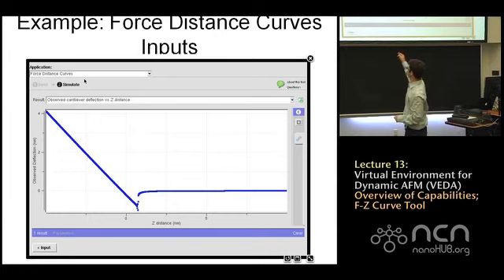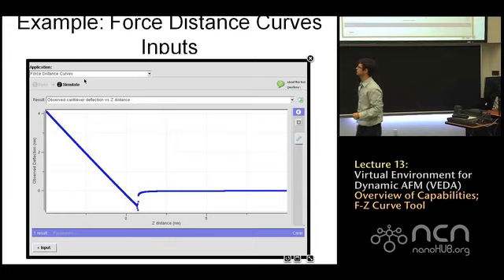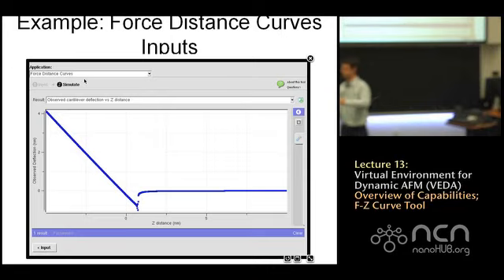We start approaching the sample from a far distance. There are basically no forces at first, or the forces are negligible far away. Then as we get closer, the tip starts to bend towards the sample under the influence of the attractive van der Waals forces. At some point, the gradient of those forces exceeds the stiffness of the cantilever, and it snaps onto the sample.